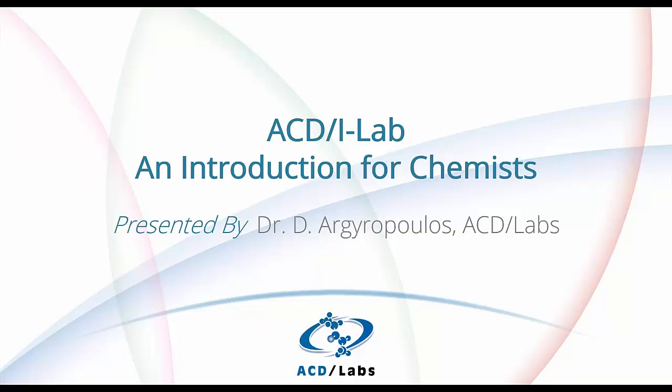So, thank you for joining us on this webinar. On this webinar, we will talk about the use of the ACD iLab interface. As I say, it's an introduction for chemists who want to use it as part of their work.